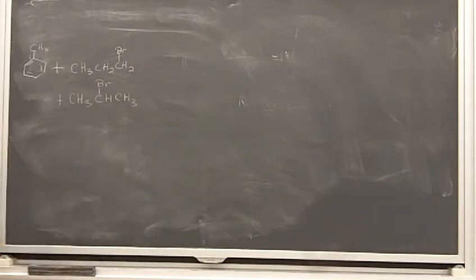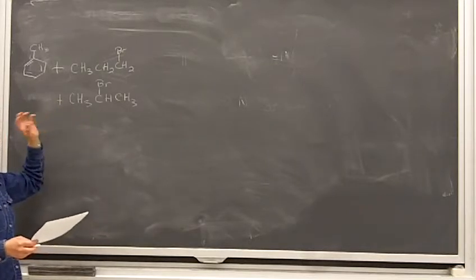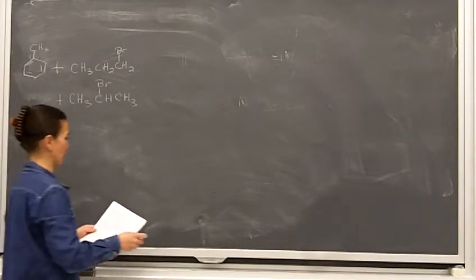Okay? And when you come to lab this week, unless your lab prof tells you ahead of time, we will tell you which alkyl bromide you're going to be using, okay? So in your pre-lab, you're going to want information for both of them, all right? It's important to have that information because in the end, you're going to compare all of the data that we're going to talk about for possibilities of reactions here.